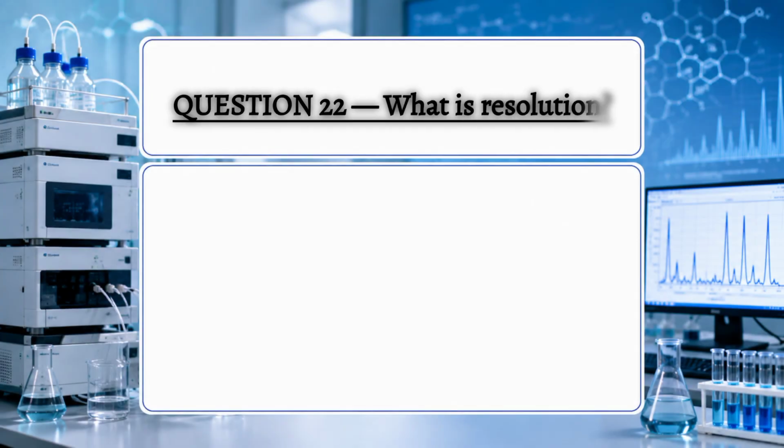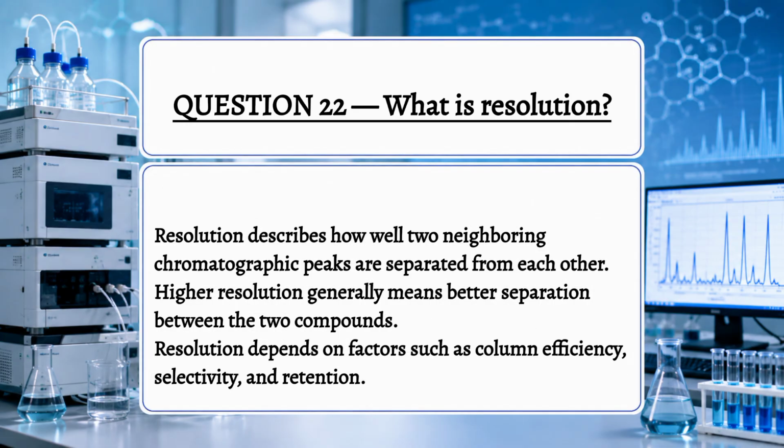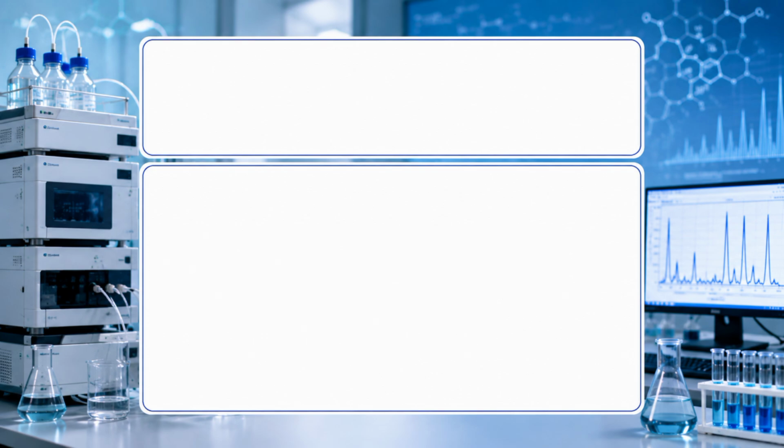Question 22. What is resolution? Resolution describes how well two neighboring chromatographic peaks are separated from each other. Higher resolution generally means better separation between the two compounds. Resolution depends on factors such as column efficiency, selectivity, and retention.